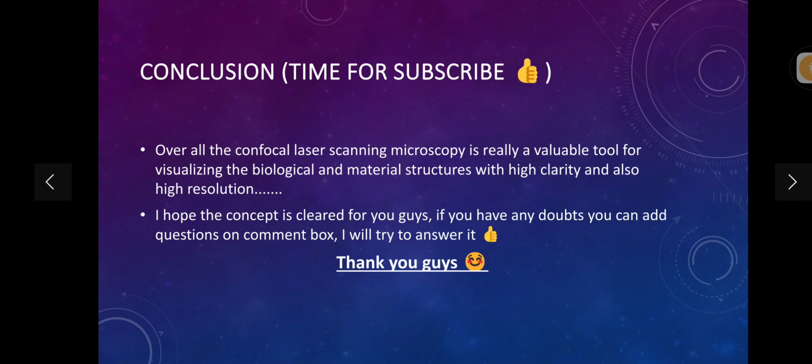After that, we come to the conclusion that CLSM, confocal laser scanning microscopy, is really a valuable tool. Is it? Yes, of course, because it gives a high resolution image.